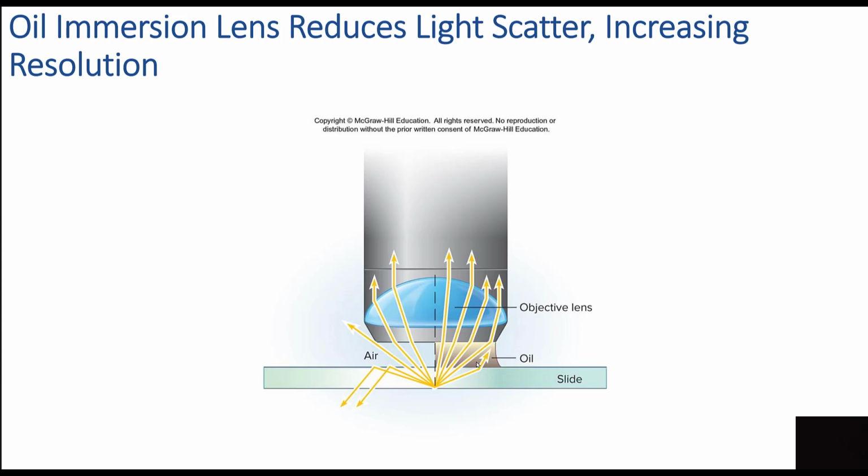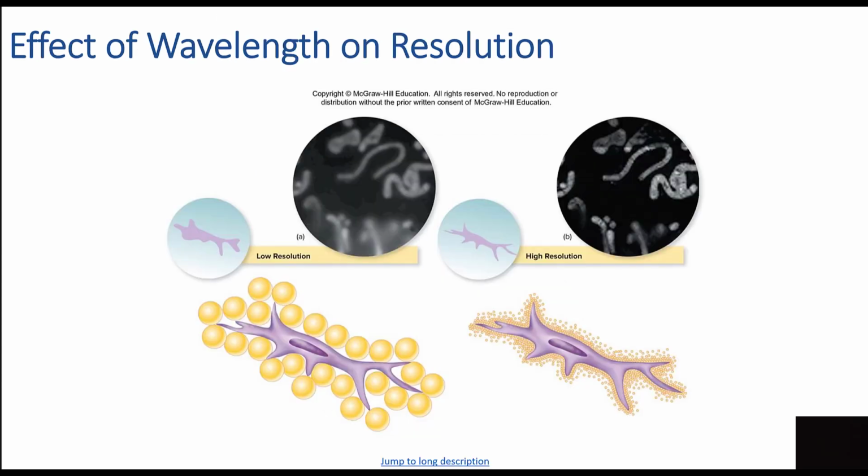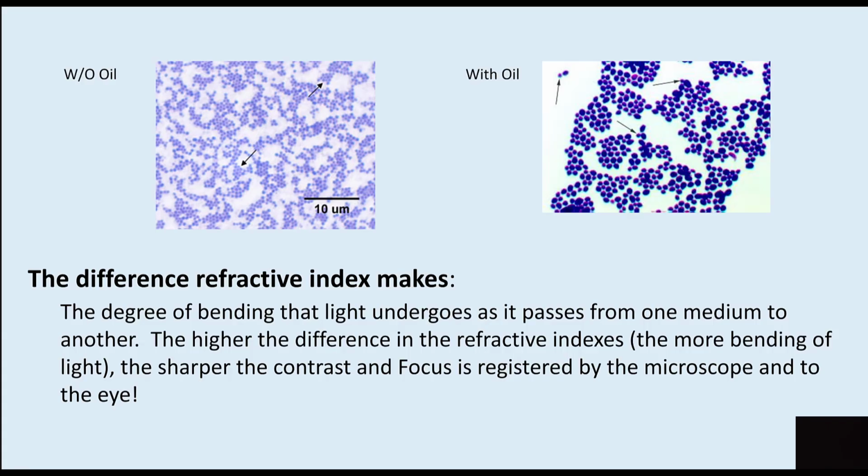That plays the trick with the refractive index versus air. Air tends to bend things out, oil will bend them in, so that's to our benefit. And we get about 250x with our scopes using that little oil trick. And that little bit actually was what the original microscope could do in total, was 250x. We use that 250x to pump out that final little bit of resolution. You can see that really makes a huge difference in our ability to view this.